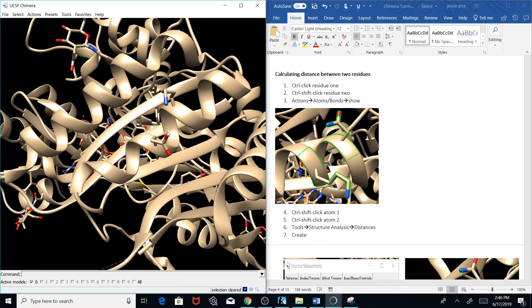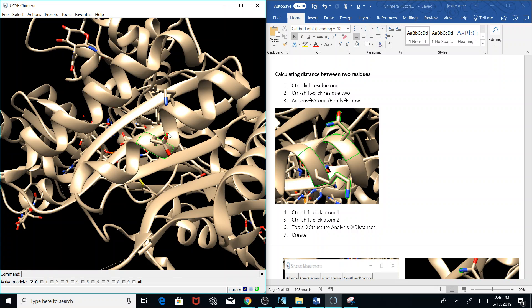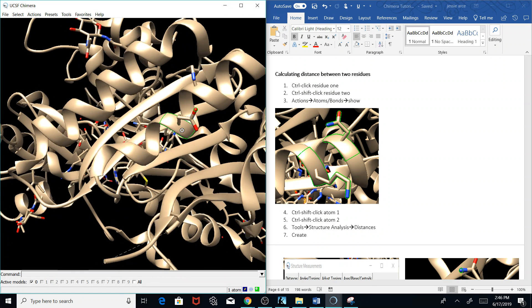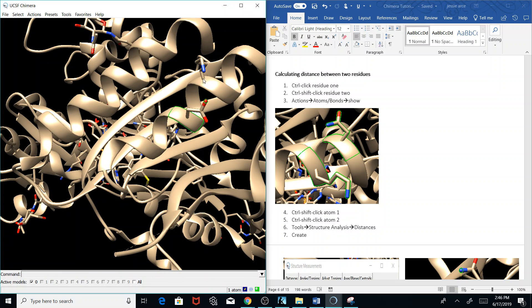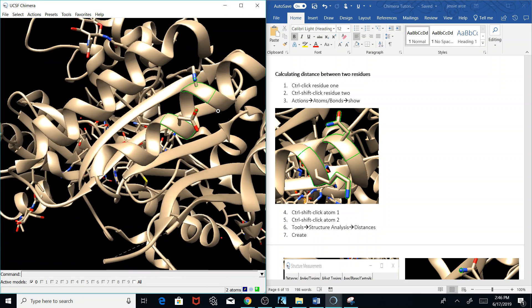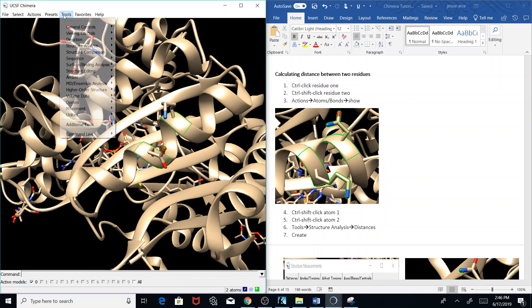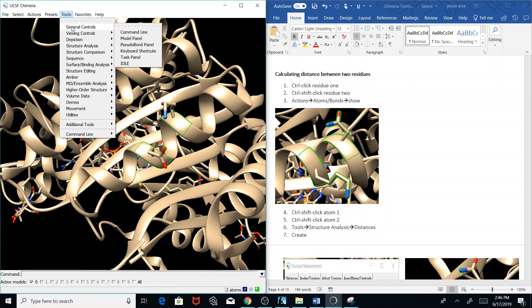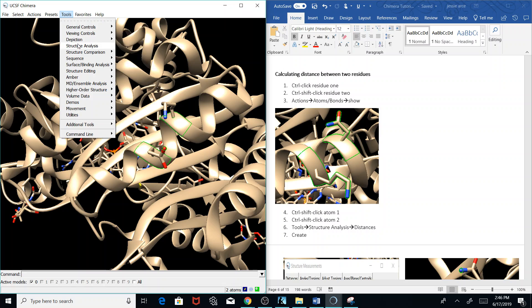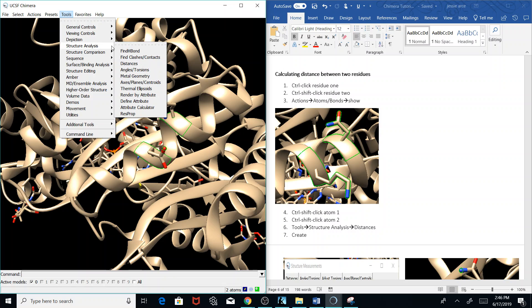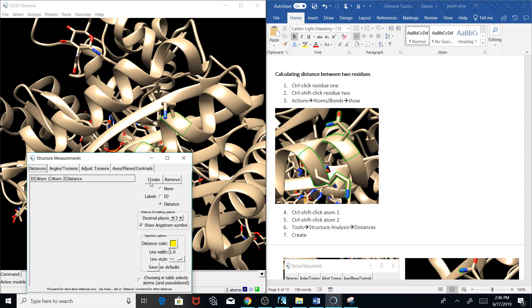Now I'm going to ctrl shift click this atom and then ctrl shift click this atom right here. Then I'm going to go to Tools, go to Structure Analysis, and I'm going to go to Distances.